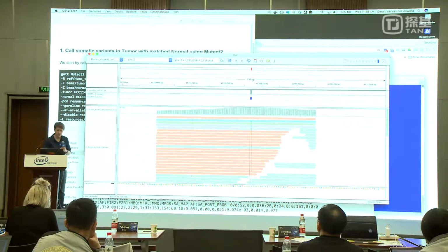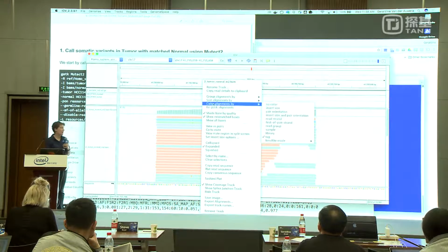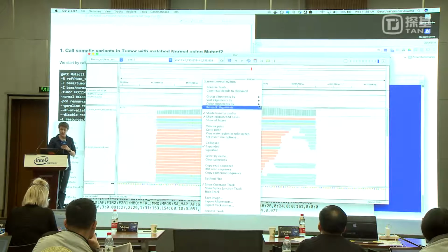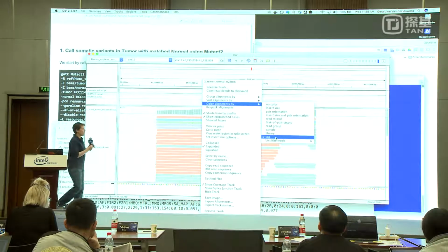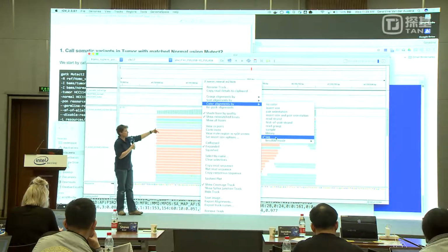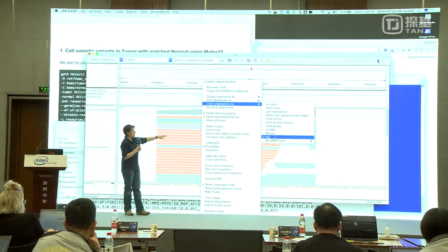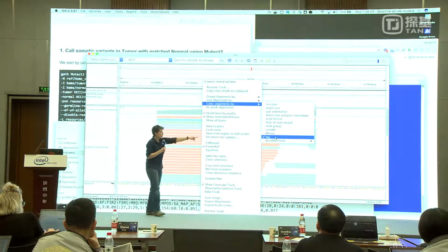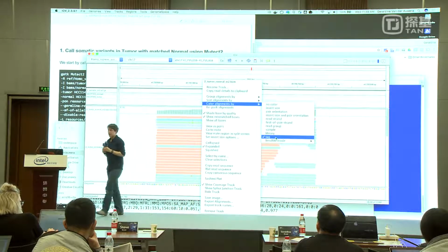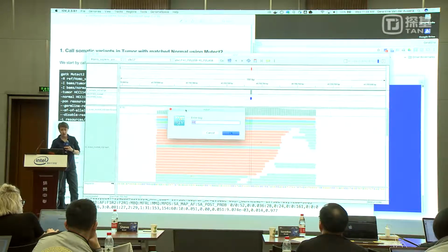But there's basically an option where if you right-click or control-click, you can choose how you color the alignments. And here I'm coloring alignments by tag, because the haplotype color tag, or in this case the Mutect tag, is what tells us what read has been determined to encode which haplotype. And so by doing this, I can get that coloring. Okay? And this is the tag we're looking for.